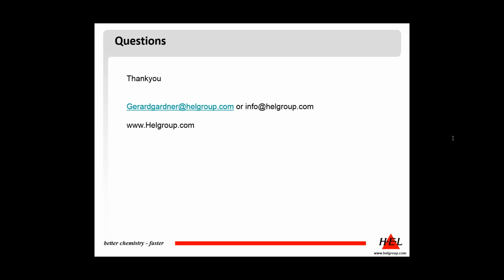I can send details on that to you. Actually, I should have mentioned that within the presentation. In terms of the robotic platforms, both with atmospheric and pressure solutions, we do have solutions for both those situations where they're integrated with the liquid handling robot.